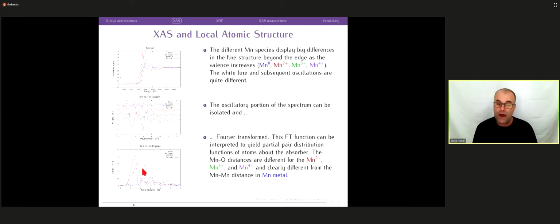It turns out, if you work through all the math, what determines the frequencies of oscillation are the distances between the atoms. If you have atoms that are closer together, then the frequency of oscillation is lower and the wavelength is longer. For atoms that are farther apart, the frequency of oscillation is bigger and the wavelength is shorter. That was a very hand-wavy explanation of something we could go into in a lot more detail, but the point I'm trying to make is that the locations of these peaks in the Fourier transform spectrum tell you something about how far apart the atoms are.